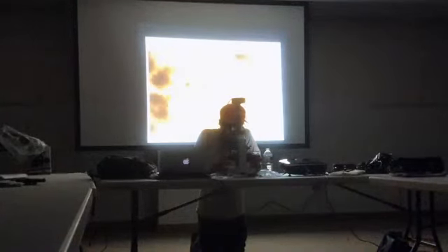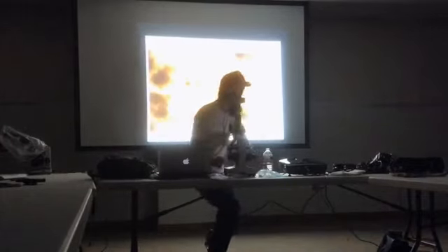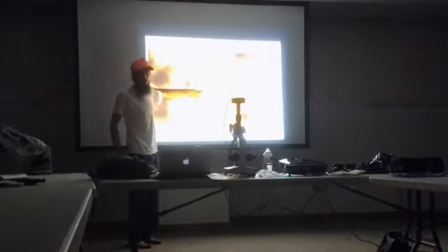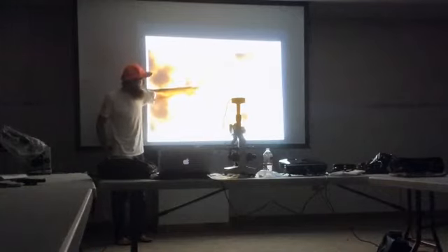And so here, okay, yeah, so here, this guy here, this is a fungus growing throughout my sample, but is this one beneficial? This guy right there looks dark.